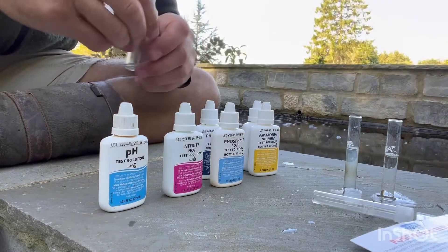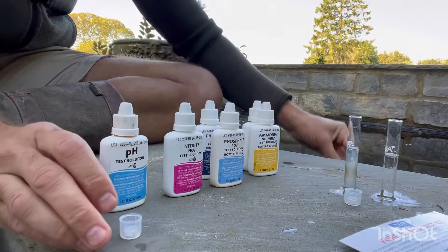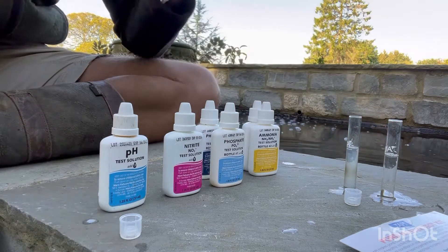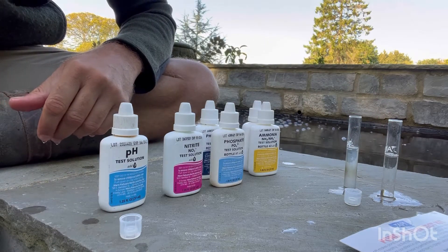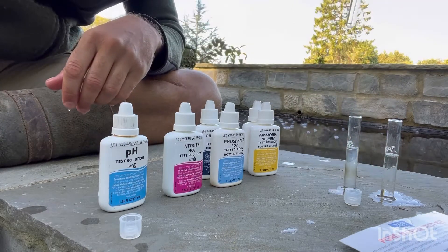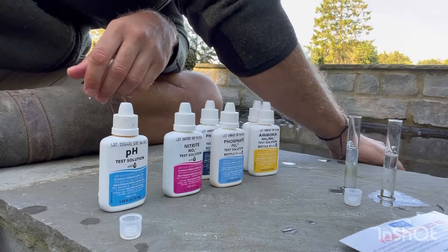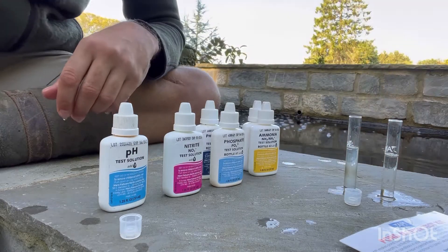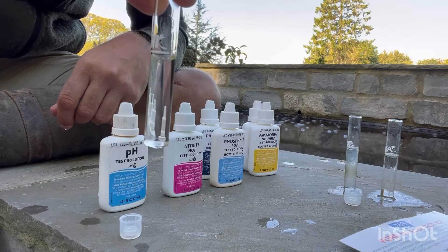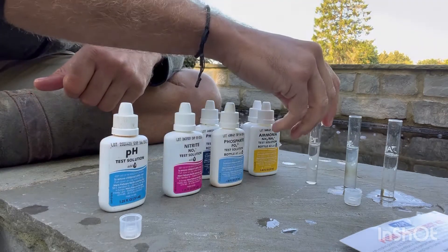I've got to be careful because I'm on a slightly uneven bluestone surround. So even though I know my tubes are clean, what I'm not going to do is if I overfill to the line, I'm not going to pour that excess back into the pond — just in case. There's just no point.